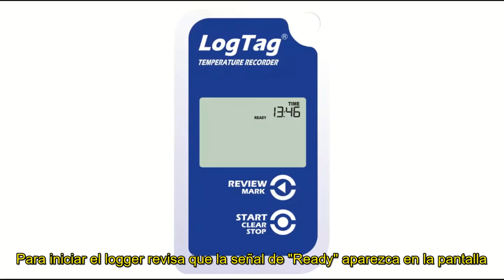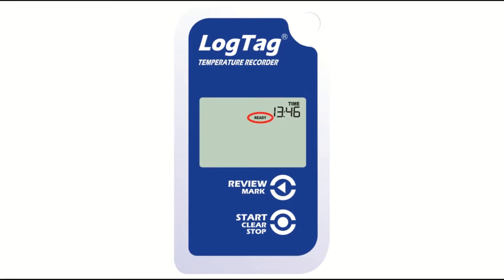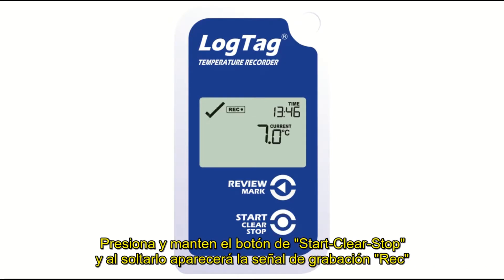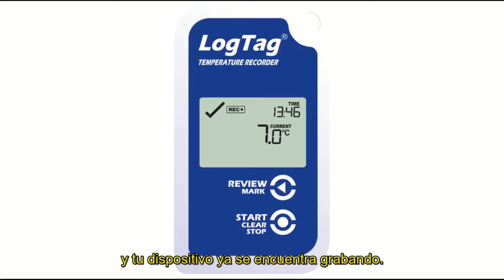To start your logger, check that Ready is showing on the display. Press and hold the Start Clear Stop button. Release the button and the recording symbol will now display. Your logger is now recording.